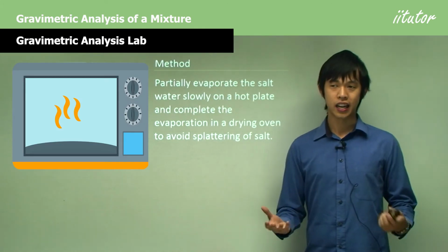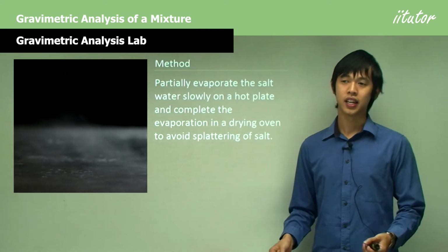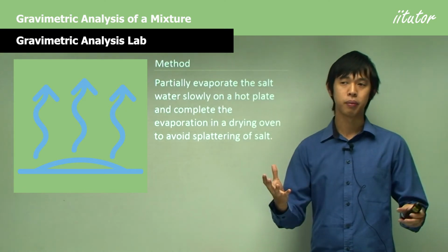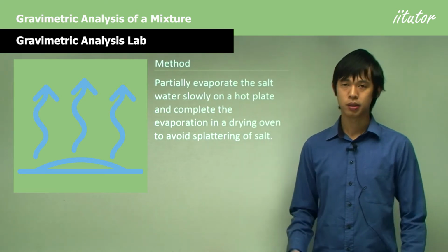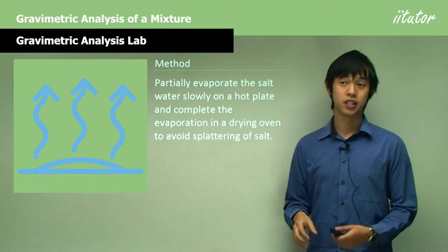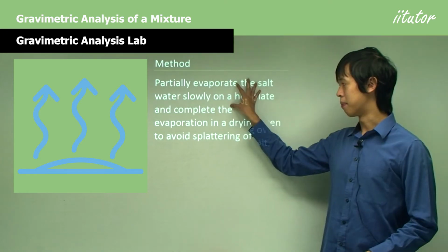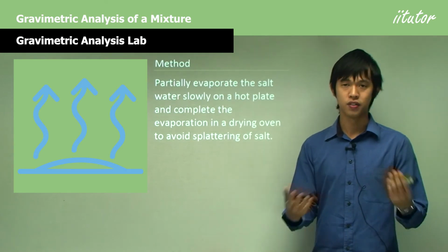You know, on a hot day, if you spill some water on the ground, it doesn't sizzle or boil, assuming it's not that hot. It kind of just gently disappears over time. Similar here, we went in the drying oven, we've got kind of hot environment, but it's not so hot that things will sizzle away. It'll just disappear on its own accord, similar to a hot day and you spilled water on the floor. With the hot plate, it's like if you pour water into a really hot pan, it's just gonna boil instantaneously and splatter and go everywhere. So this is just to get it high temperature without boiling, and then the drying oven is just to get rid of the water over time.